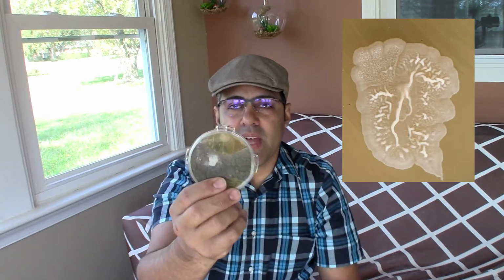I'm not saying that we discovered an antimicrobial agent here. We know as a fact that yeasts, for example Pichia, resemble that pattern on plates.